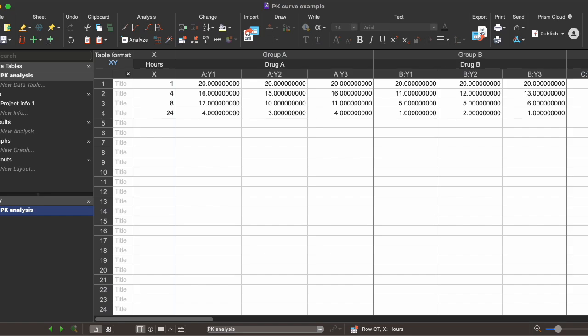On the x-axis we have hours from administration — so either 1, 4, 8, or 24 hours from drug administration — and on the y-axis we have a number of replicates for whatever your readout is. It could be fluorescence intensity, radioactivity, or area under the curve depending on the assay. Here I'm showing drug concentration at these different time points.